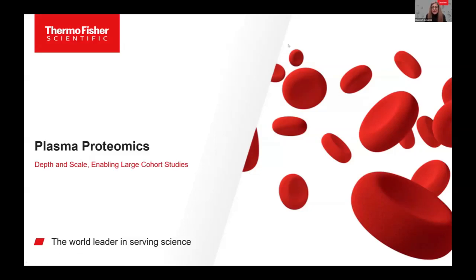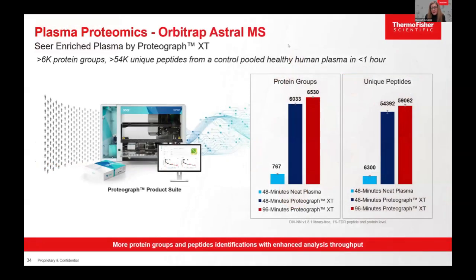And then the best thing is, okay, I have DIA, I have evaluated it in cell and tissue, and what is next? Because this box can do so many DIA runs in a day, like 48 with the 30-minute method, what can I do? One application of it is plasma proteomics. We have evaluated neat digestion, easy prep neat digestion in a 96-well plate, and also the Seer Proteograph system, which uses nanotechnology for sampling the proteome in plasma or biofluid.